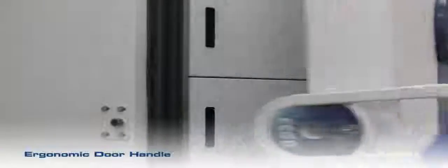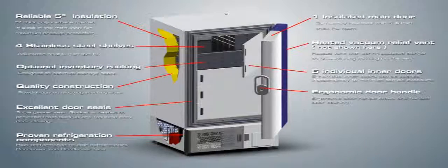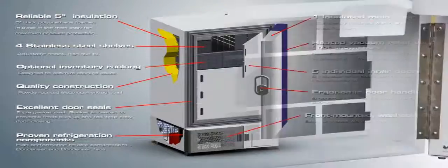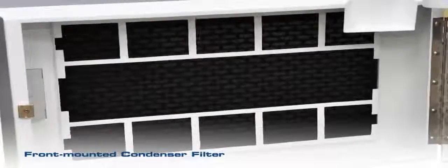An ergonomic door handle allows one-handed door opening. Key locks are provided with every unit to prevent unauthorized access. A washable filter is front mounted for easy access without tools.